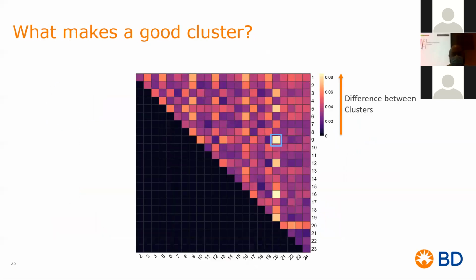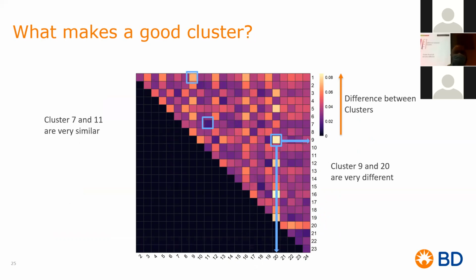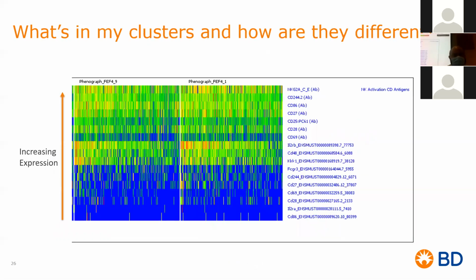Now, here, oh, now my box is here. Then the other one is cluster 1 and 9. So I'm going to show you these comparisons that I did.